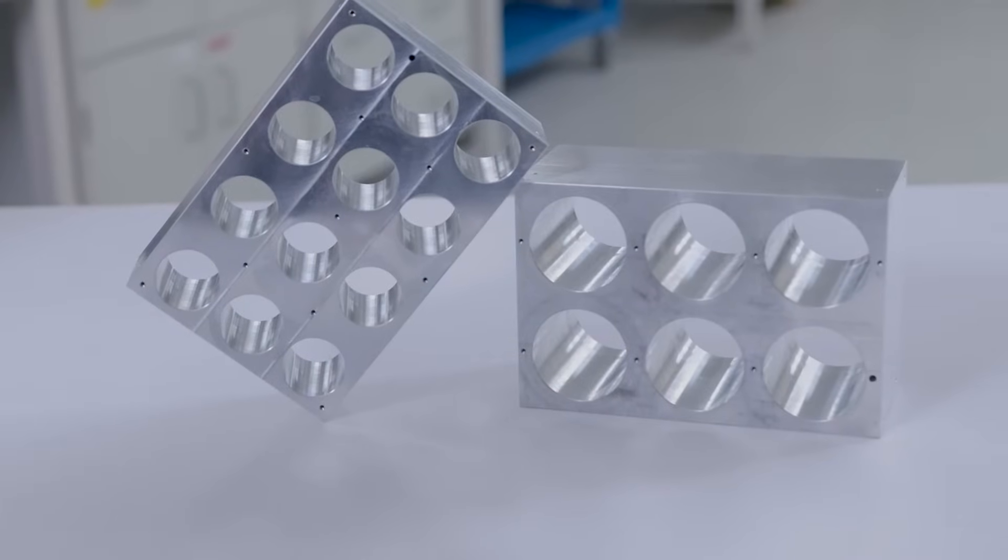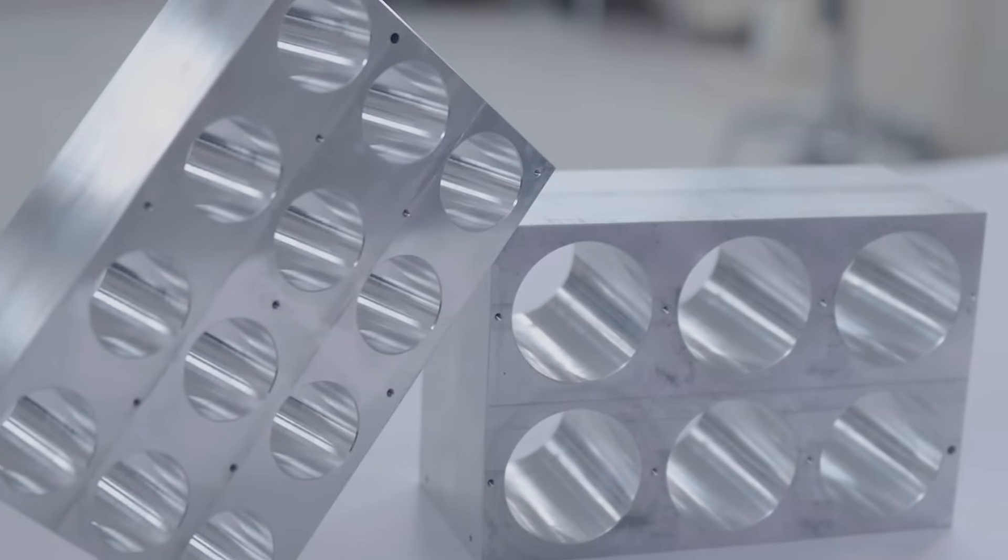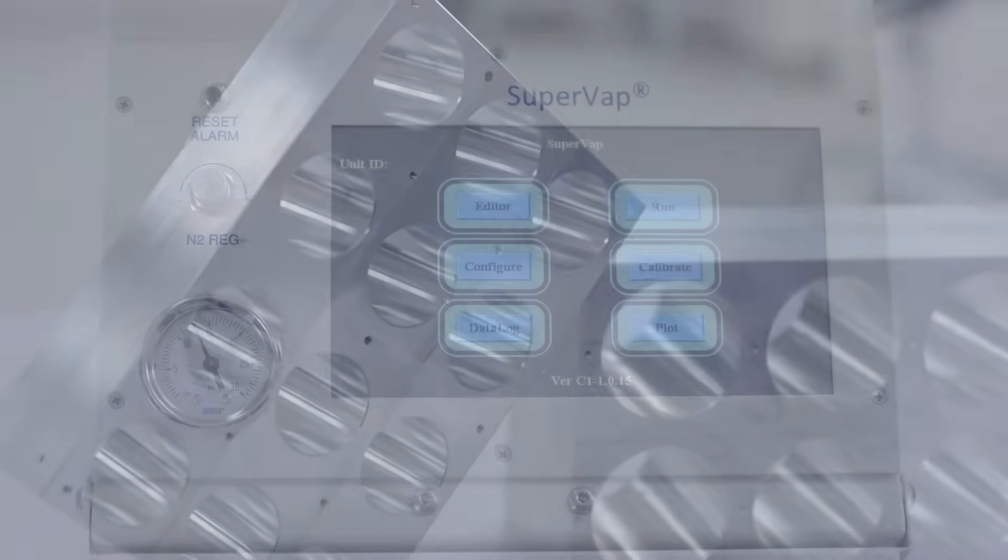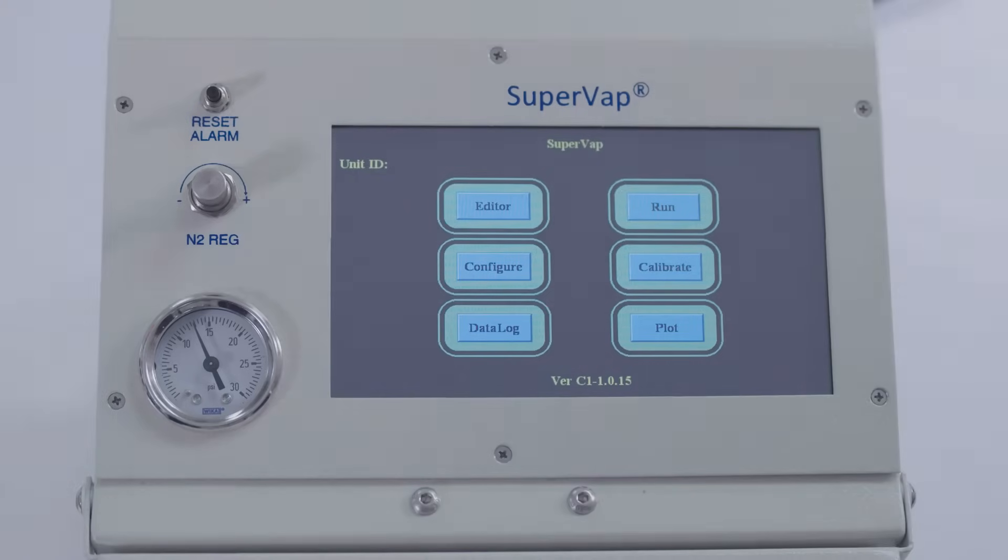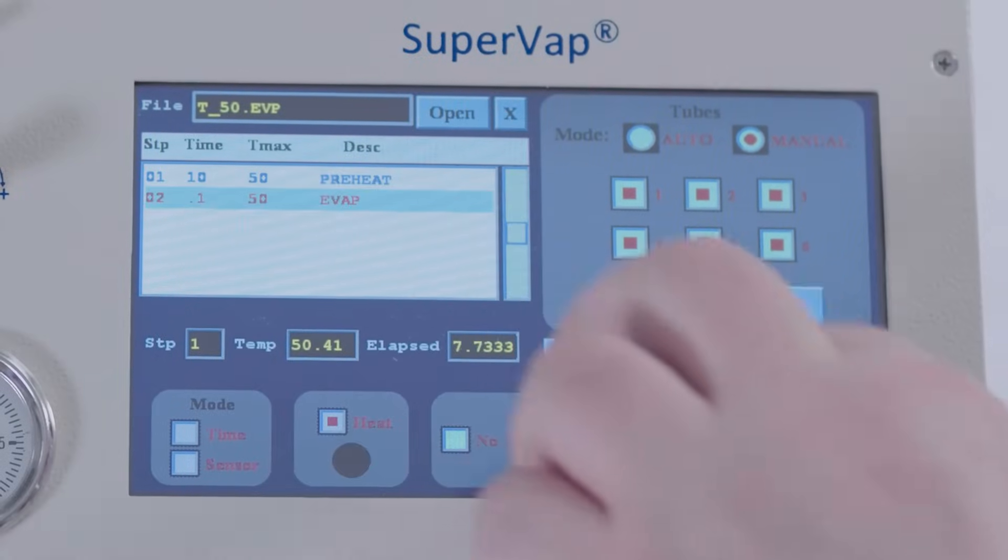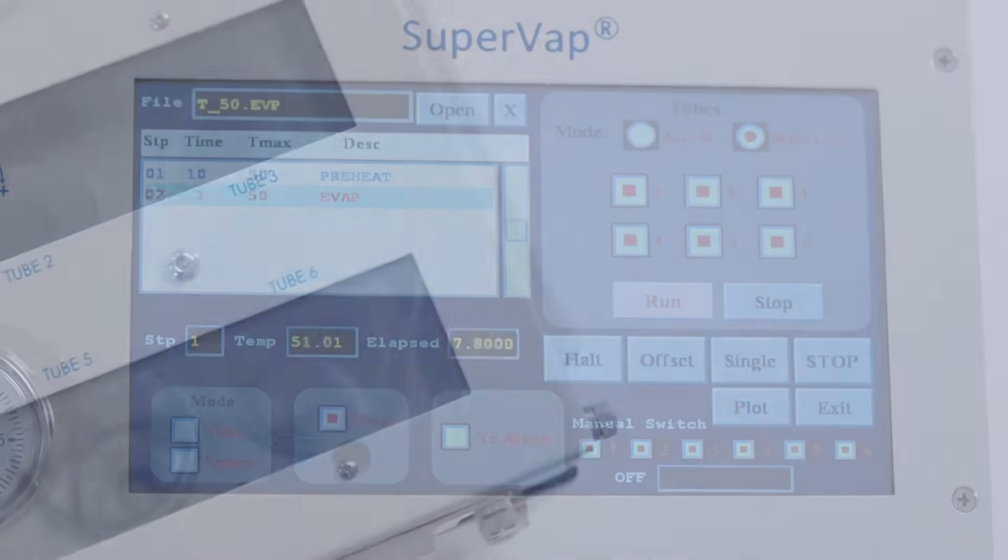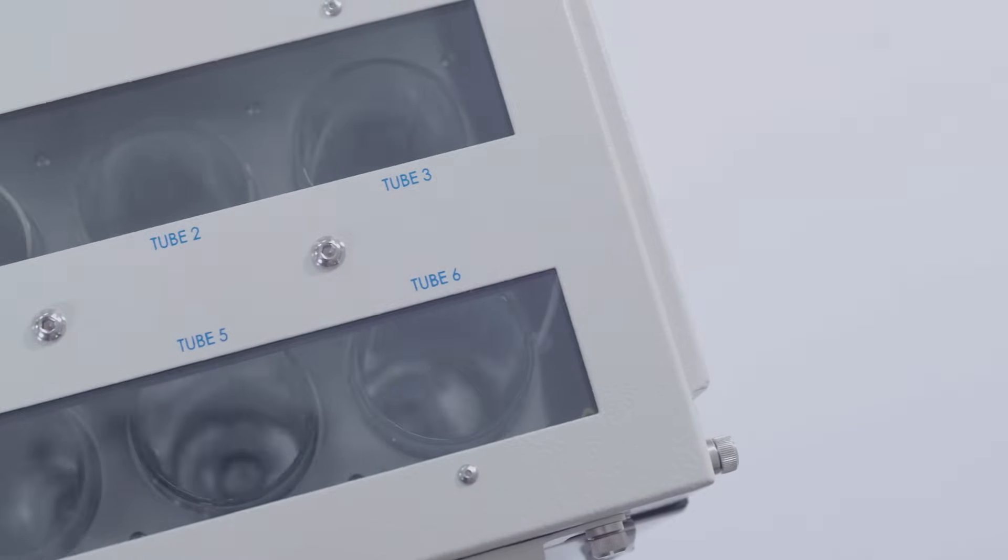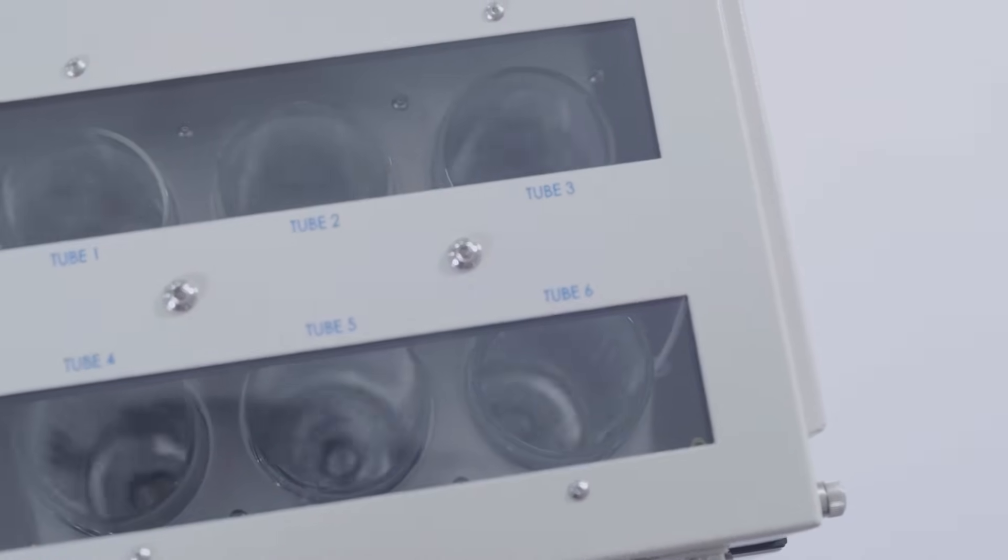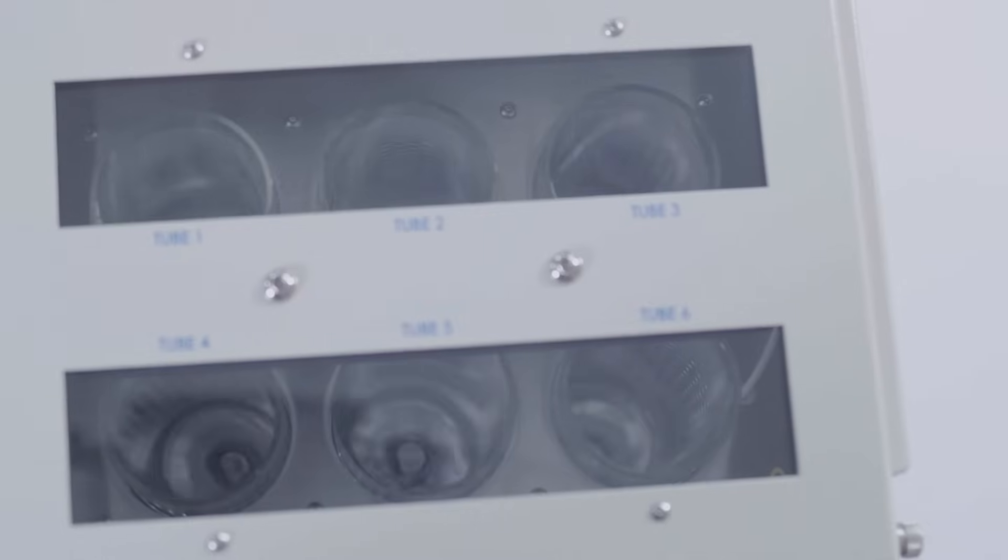The SuperVap concentrator is a dry, waterless system, which is programmable. It can preheat as well as ramp up to final temperature. It automatically senses the extract being delivered to each vessel, starts nitrogen blowdown, and shuts off nitrogen when the final volume is achieved.